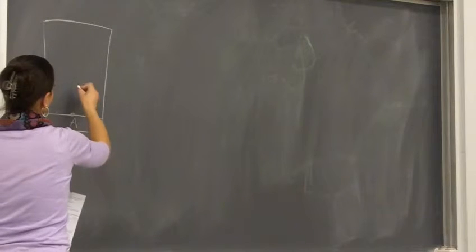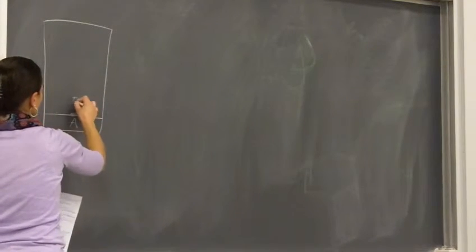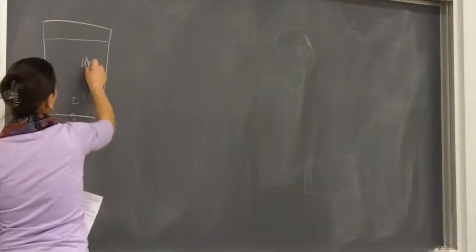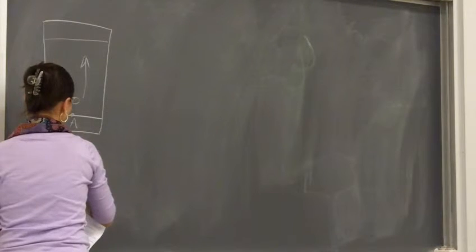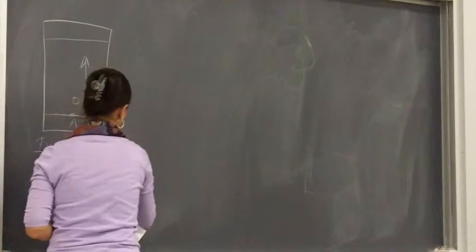Okay? So we've got our spot on our TLC plate here, and say we've got compound A developed here. Here is where our solvent is. What do you think we should do to improve the way that compound develops on the TLC plate? Then we're going to increase the polarity, right? If we want it to go up, we would increase the polarity of the eluent. We're not changing the polarity of the spot, it's of the eluent.